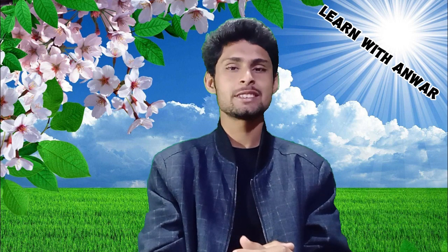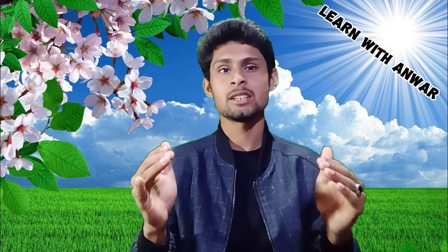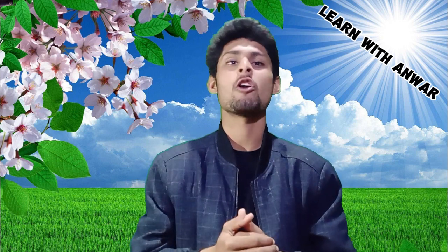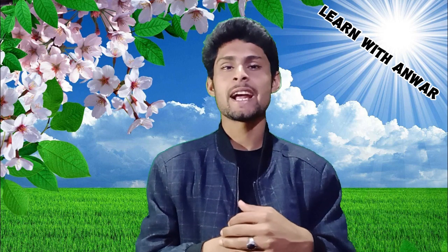First of all, we discussed that the microscope is an instrument that produces an enlarged image of a small object, allowing the observer a closer view of minute structure at a scale convenient for examination and analysis.